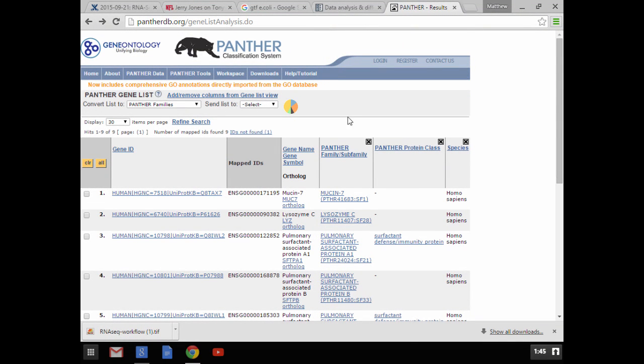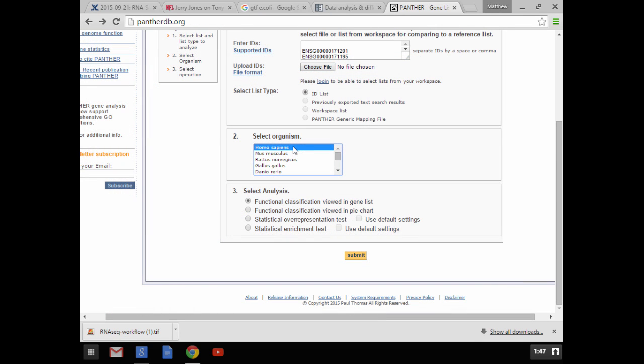Back to where we came from. I can just take this and export it to text and have my list of gene names, so that I can take that as a table and hand it to somebody else and say, these are the genes that are differentially expressed. Pretty easy, right? So the next thing, this was just, I just wanted to see what the classification of the top 10 were, and I was happy that those came out.